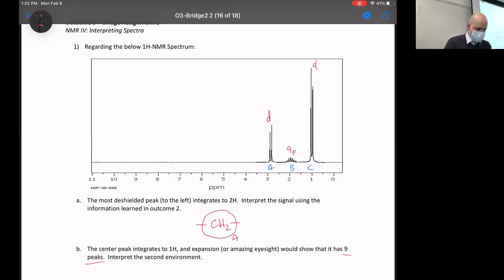All right, it's around like 2.9 ppm. So it's not perfectly clear, because it's not 3 to 4 and it's not 2 to 2.5. What we can say for sure is that it's a doublet, and a doublet definitely means that it's next to what? Okay, so what is it next to specifically? Right, so it's got to be next to a CH. Besides that, what do you think is on the other side? Got a lot of different answers for this.